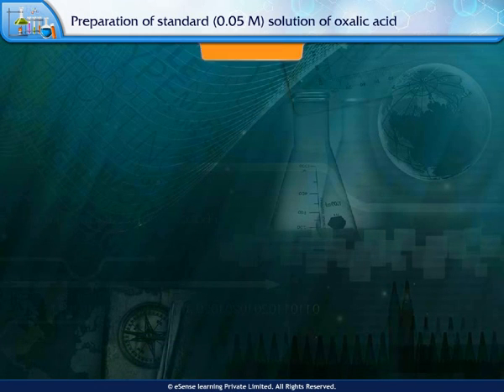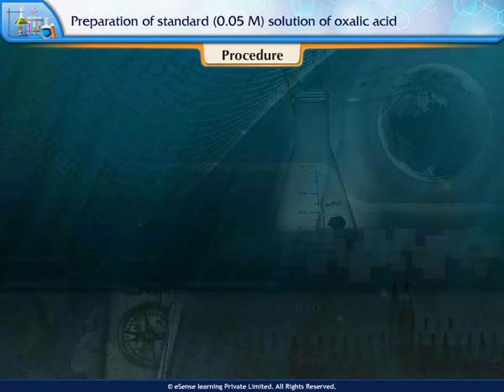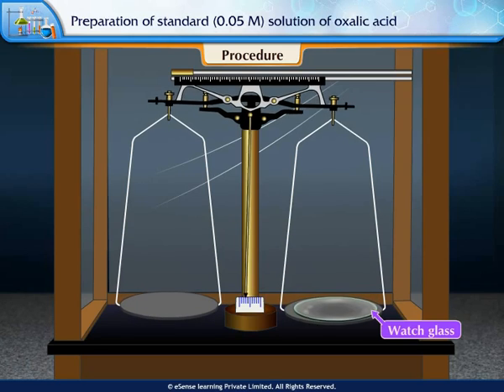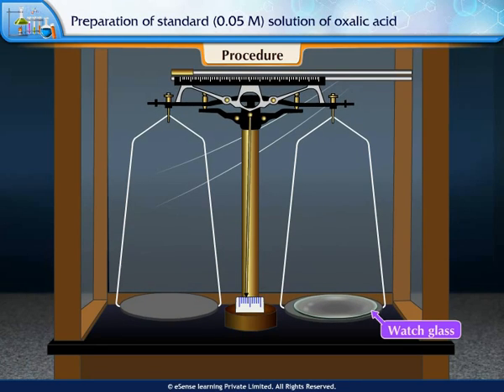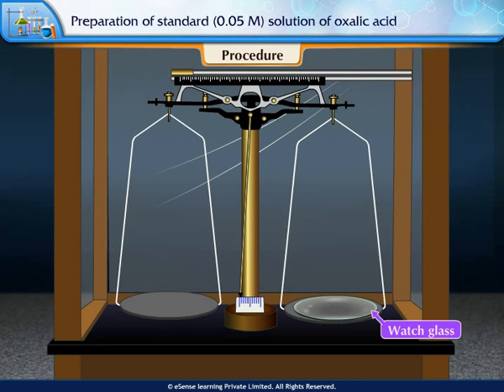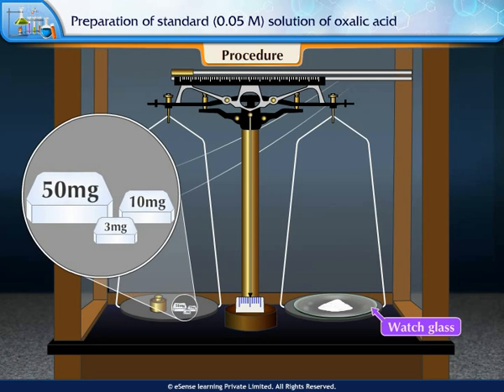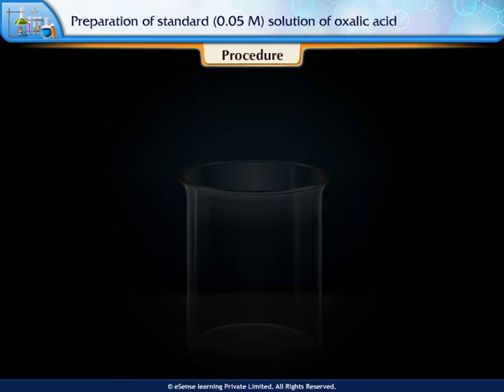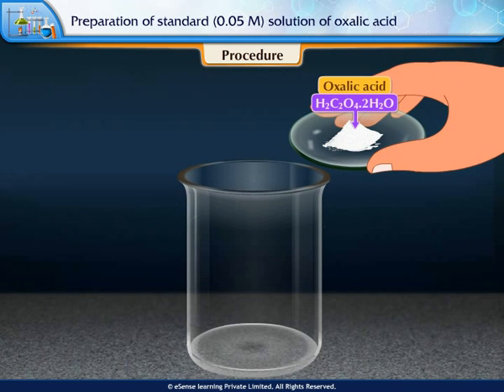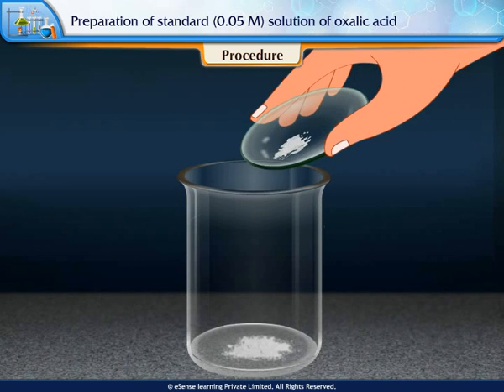To perform the experiment, place a watch glass on a chemical balance and tare its weight. Now weigh exactly 0.63 grams of oxalic acid on the watch glass, then transfer the oxalic acid to a clean beaker.